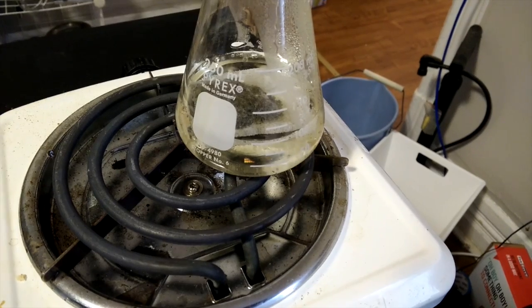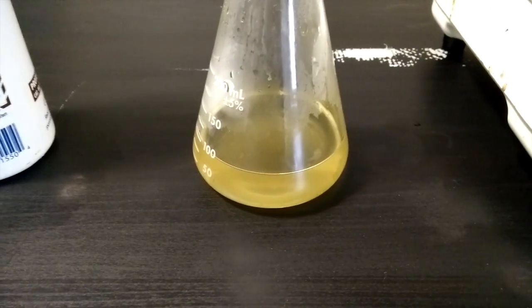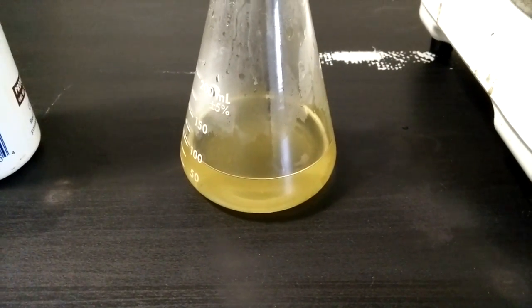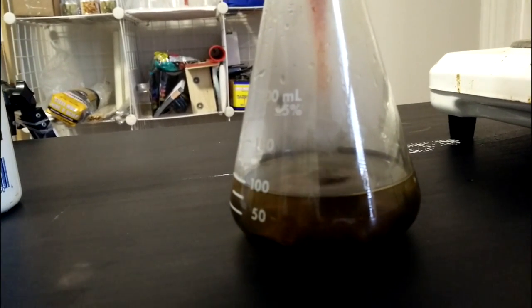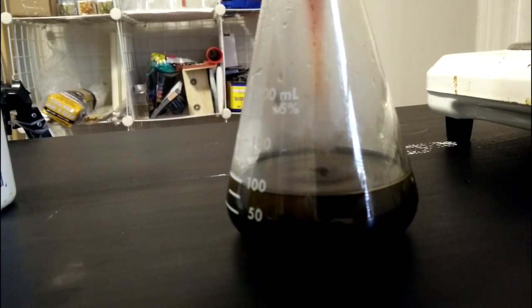Here I'm using deionized water in an Erlenmeyer flask but a jar and tap water will work fine. In this example I'm using a hundred mils of tea and three mils of iron chloride but feel free to play with the concentrations.